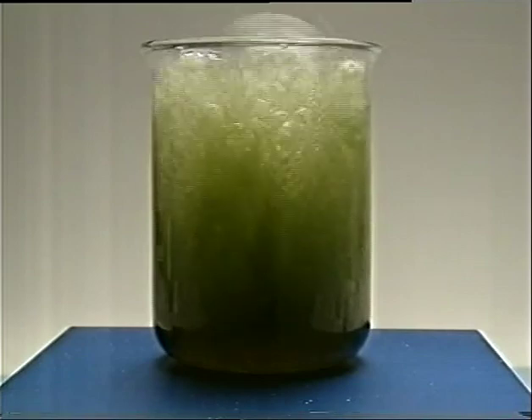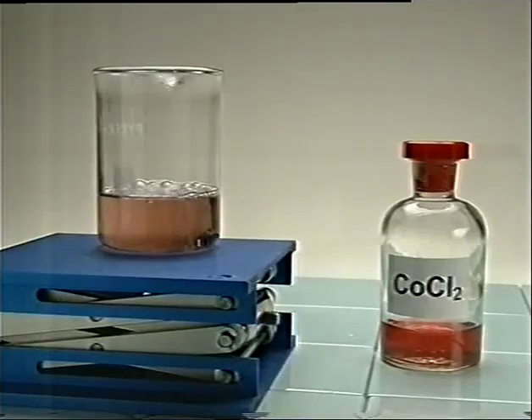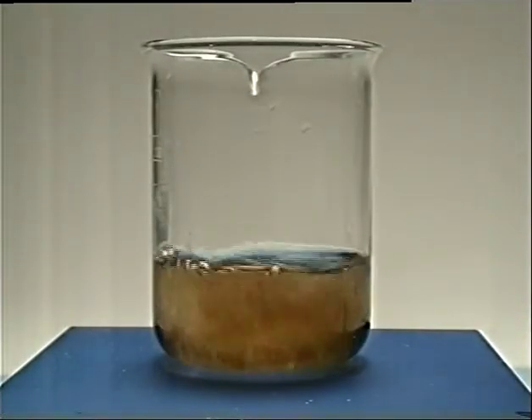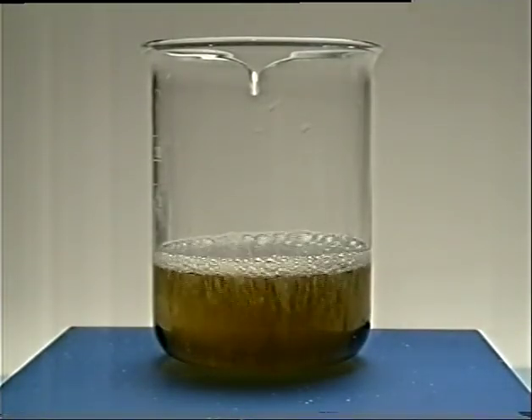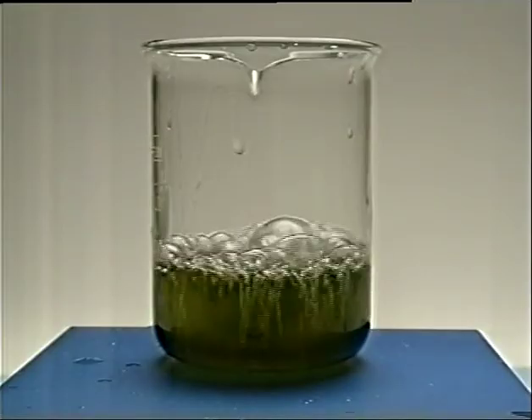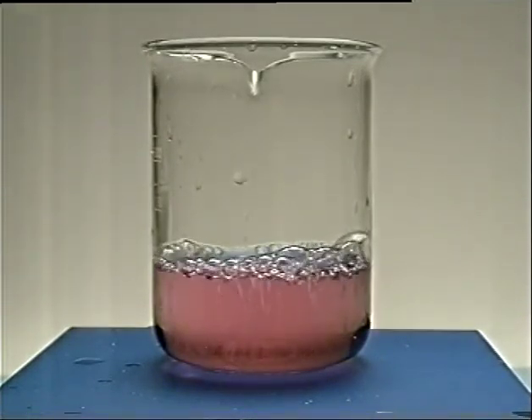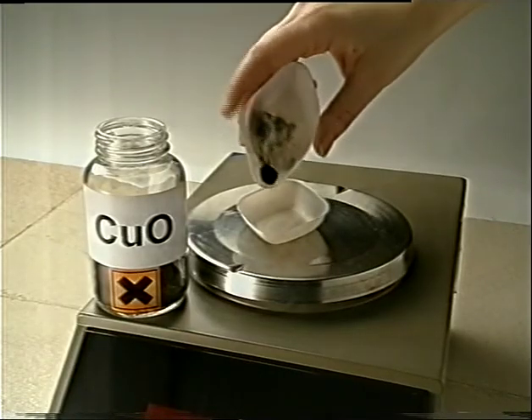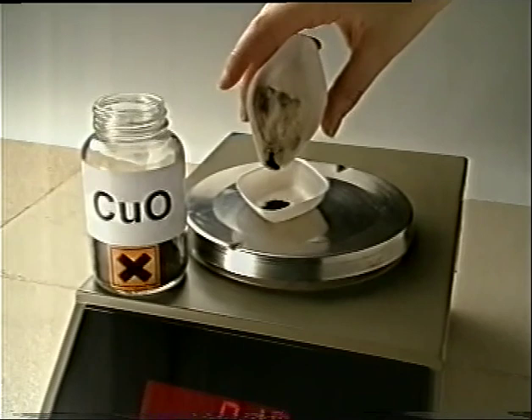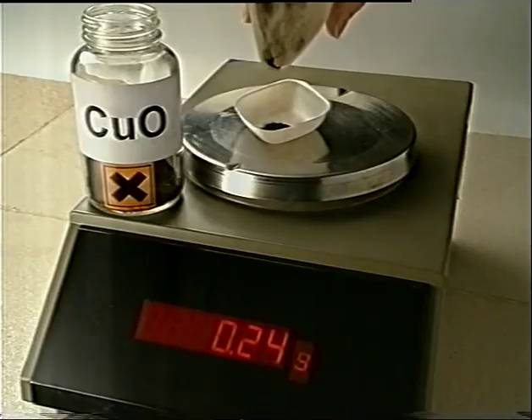A catalyst is a chemical that takes part in a reaction but doesn't get used up. Look again at what happens to the colour of the cobalt chloride. At the end of the reaction, the pink cobalt chloride has returned to its original state. So the amount of any catalyst added to a reaction should still be present at the end. For this next reaction, we'll be using 0.25 grams of copper oxide.